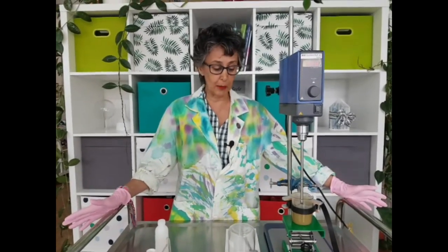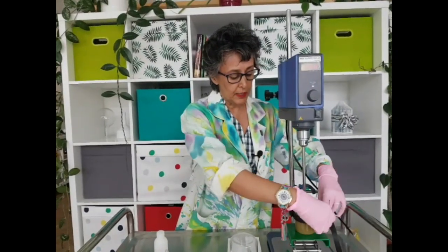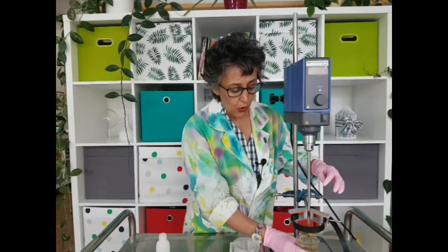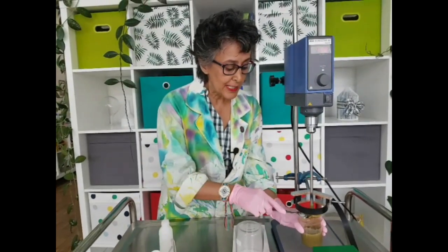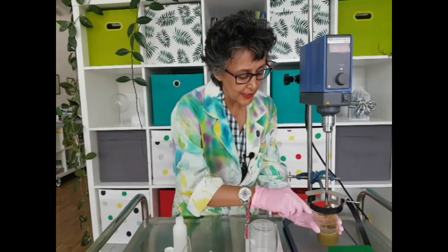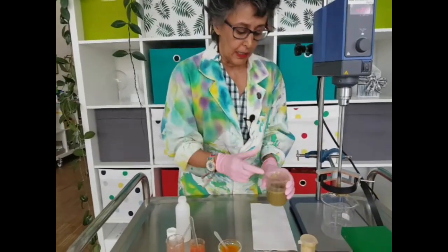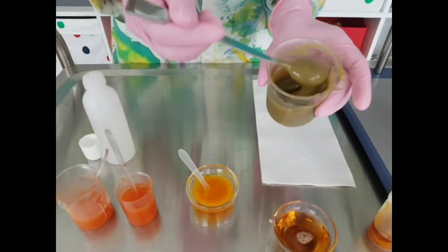How to work with Sapojel? In our laboratory, we work with an IKA Eurostar overhead stirrer, which makes your life much easier when working with this material. And you can see how beautiful this product is — this is a clay mask, self-preserving, that we have made with Sapojel.